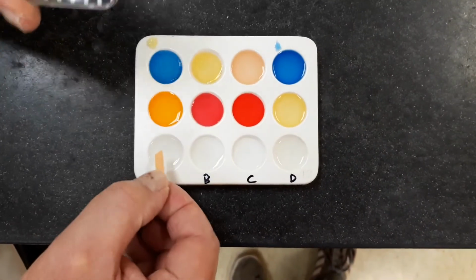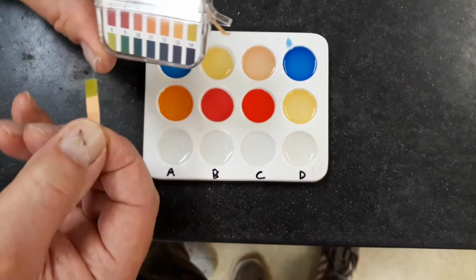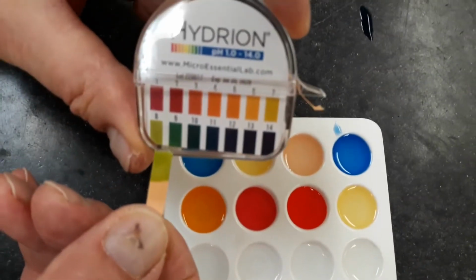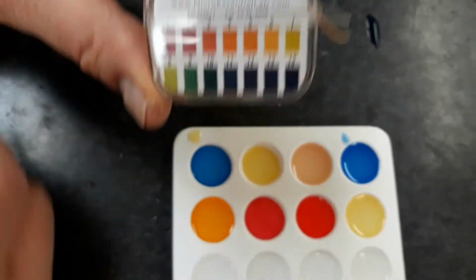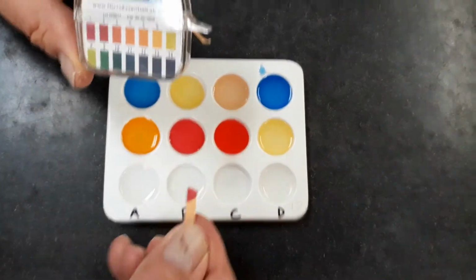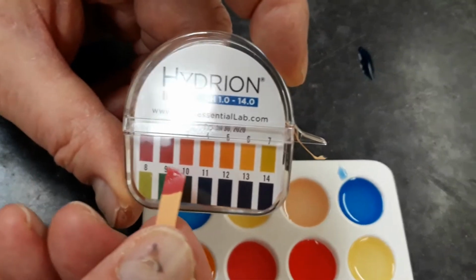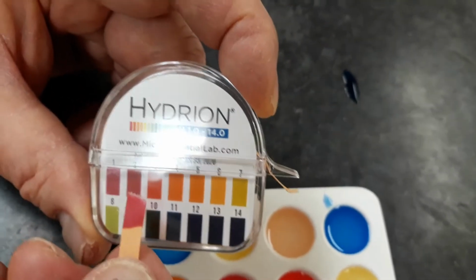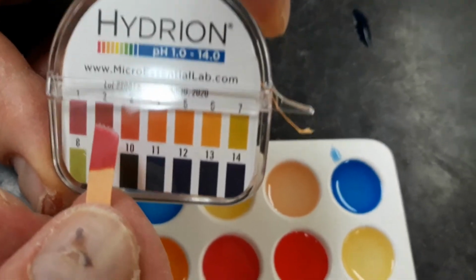Okay, pH paper. There's substance A. Looks like it's about an 8.5. And you can put pale green. Substance B looks like about a 2.5. And you can put orangish red.